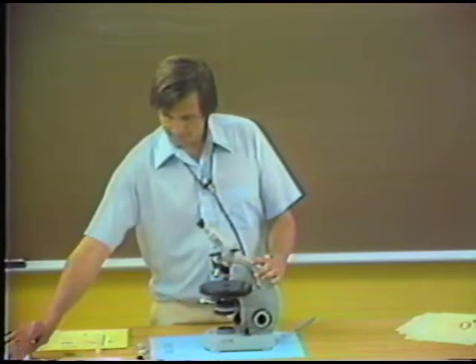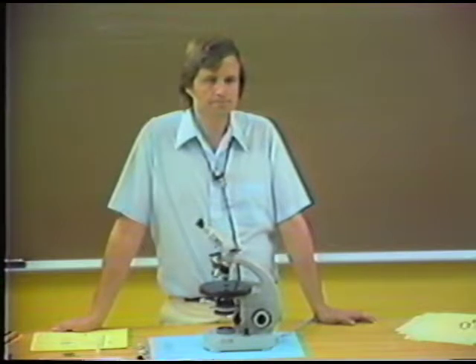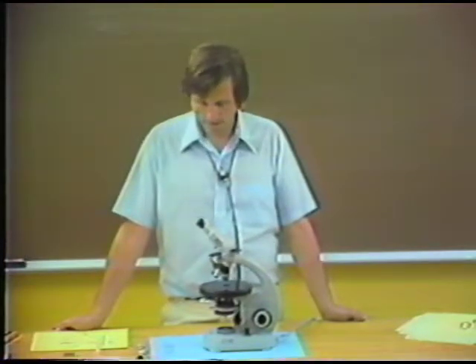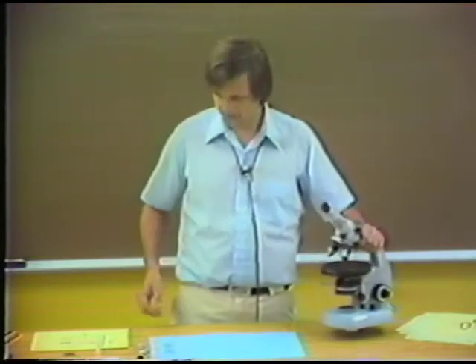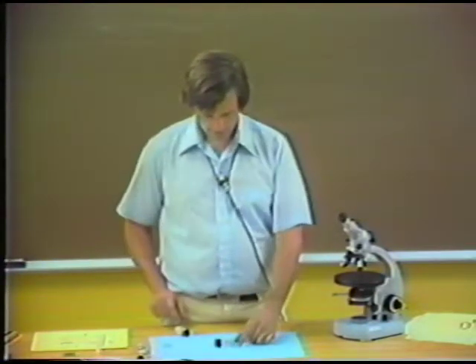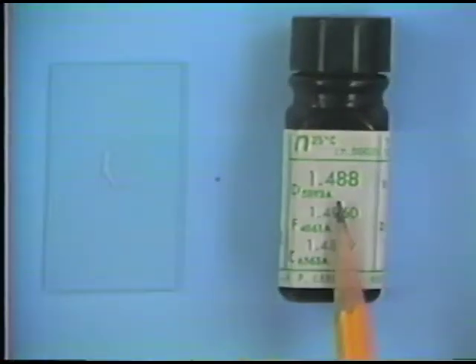Well, now we want to get closer to the refractive index of this crystal. And so I want to demonstrate what happens when you get very close to a match between the crystal and the immersion liquid. Let me show you, I've prepared already a couple of mounts. The first one is a mount in an index of refraction oil of 1.488.